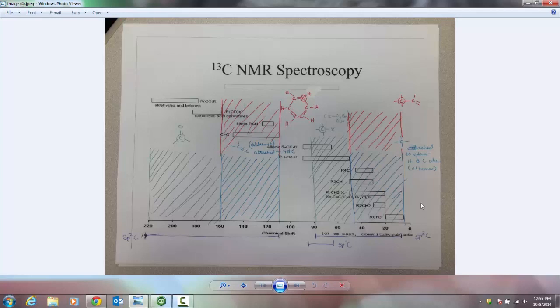This is a carbon NMR chemical shift diagram, and it goes from 0 to 220. The scale is different, but the trends are exactly the same. In this region, from just a little bit above 0 to usually about 80-ish is where we find our sp3 hybridized carbons. And in this region, from about 110 to about 220 is where we find our sp2 hybridized carbons. And right smack in the same region as our sp3s, we find our sp hybridized carbons.